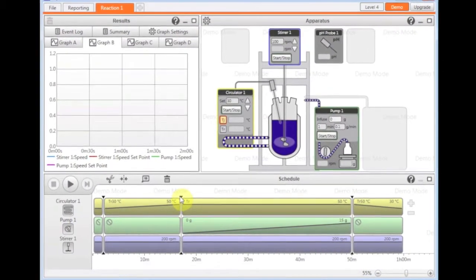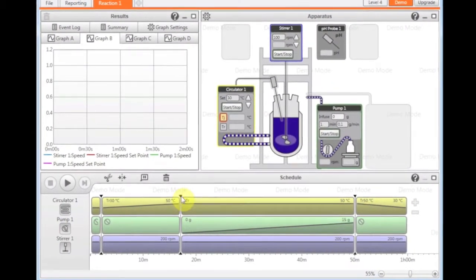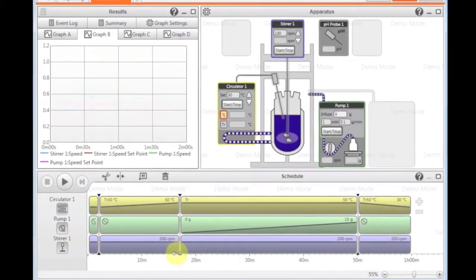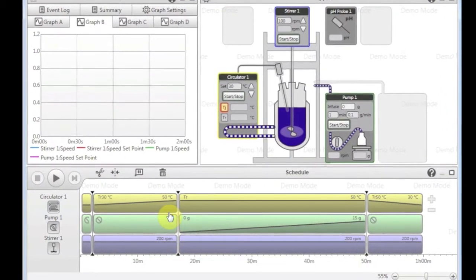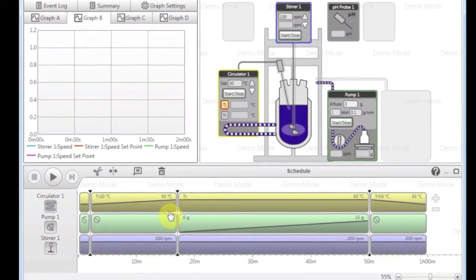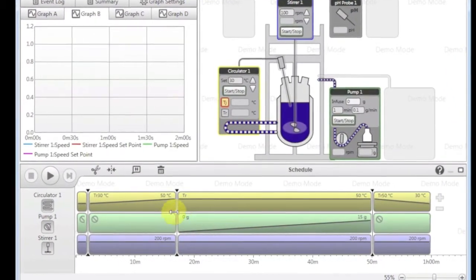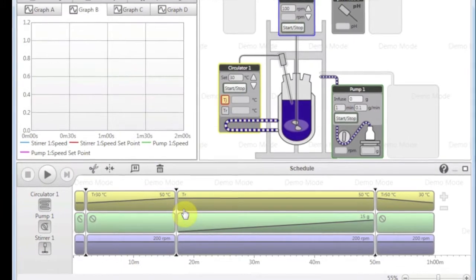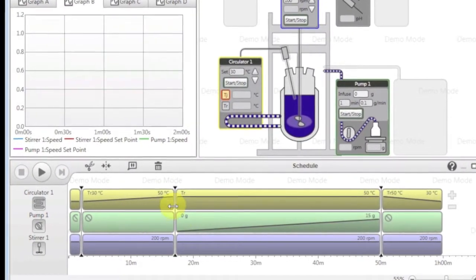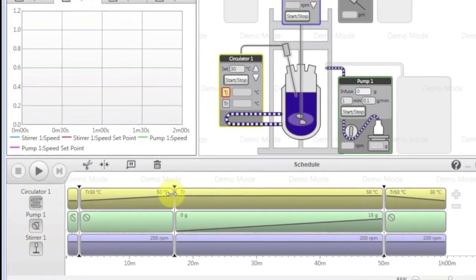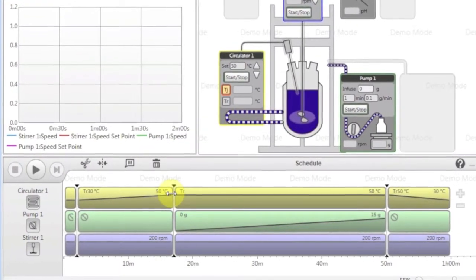Anywhere you get these little arrows, it shows that the steps are linked together and that as this one finishes, this one starts, meaning that the addition won't start until the reaction has reached 50 degrees.